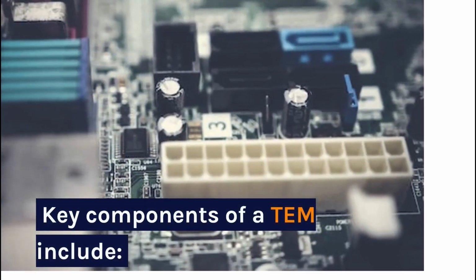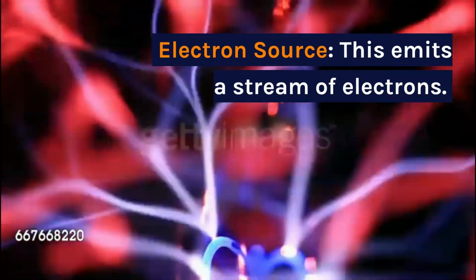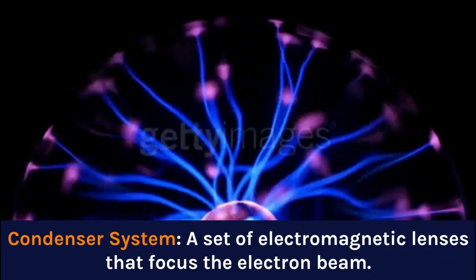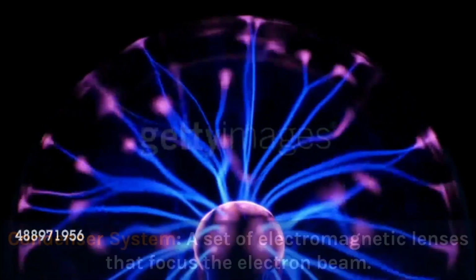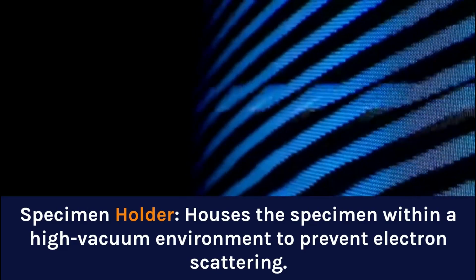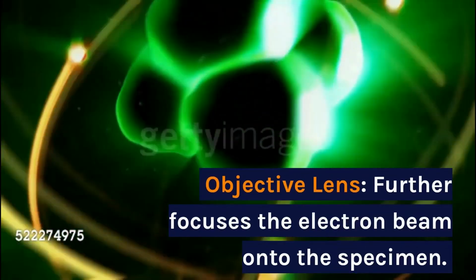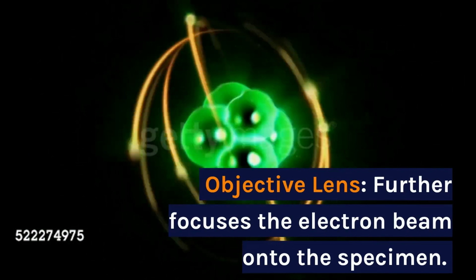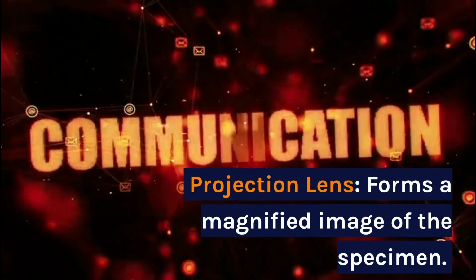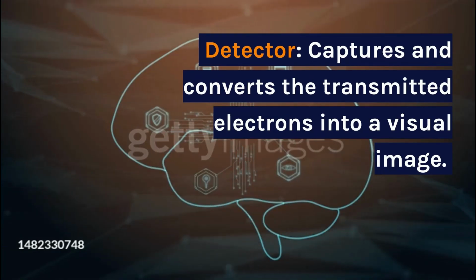Key components of a TEM include: electron source, which emits a stream of electrons. Condenser system, a set of electromagnetic lenses that focus the electron beam. Specimen holder, which houses the specimen within a high vacuum environment to prevent electron scattering. Objective lens, which further focuses the electron beam onto the specimen. Projection lens, which forms a magnified image of the specimen. Detector, which captures and converts the transmitted electrons into a visual image.